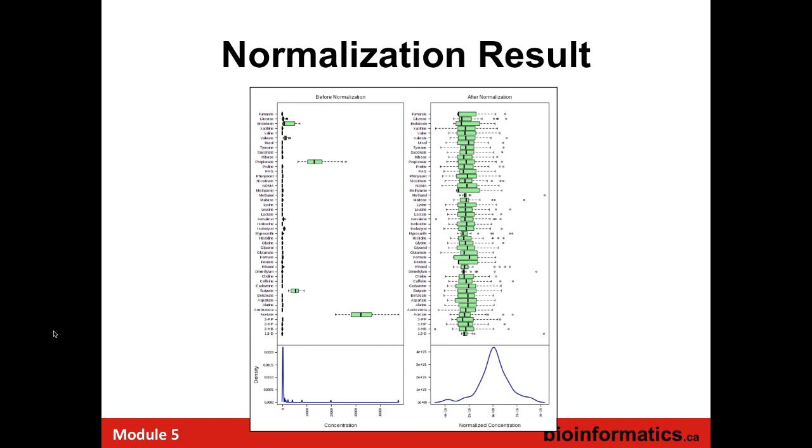It's very highly abundant, tens of thousands, and really a lot of low abundant. It's several orders of difference. And you really expect it to be normally distributed? No, it's not. But within a population, when a particular concentration of the metabolites should be, we can expect it to be normally distributed. But all the metabolites within one particular sample, you want to be normal distribution. There are something biologically I don't think it makes sense. We can do it, no problem. It's just the student who did that.